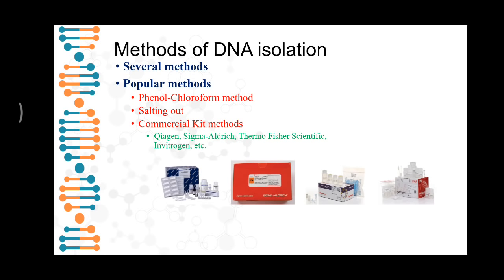So as said, there are hundreds and thousands of methods of DNA isolation. So we'll discuss the popular methods basically. Here, the three methods as we mentioned: the phenol chloroform method, the salting out one, and one with a commercial kit.